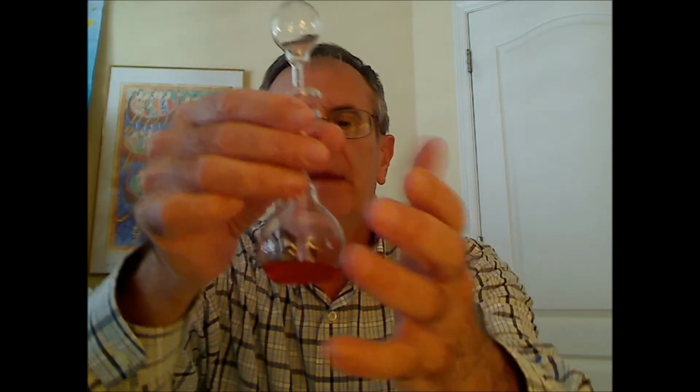The liquid has a high vapor pressure, and when you heat it up with your hands, especially if you have hot hands, you could cause it to look as if it's boiling. I'm going to use it today to illustrate distillation.